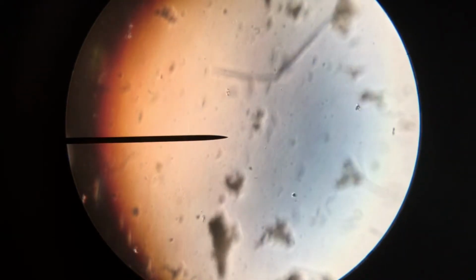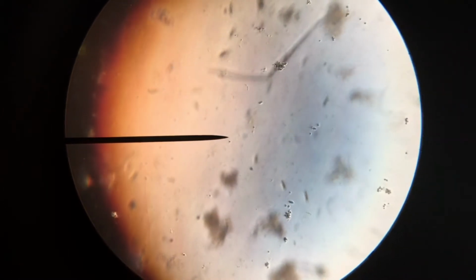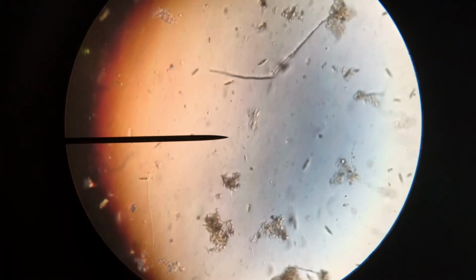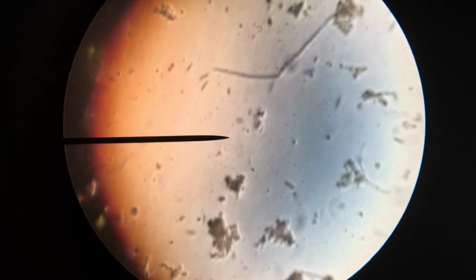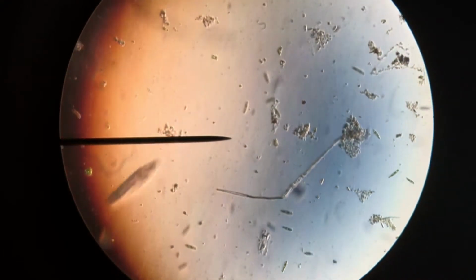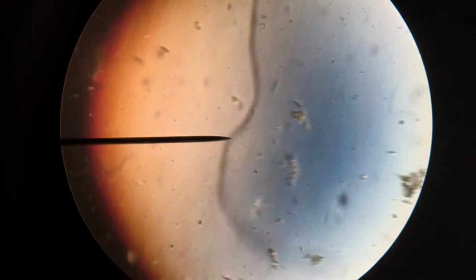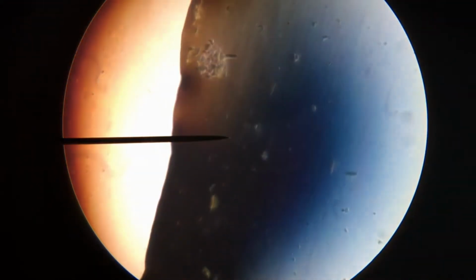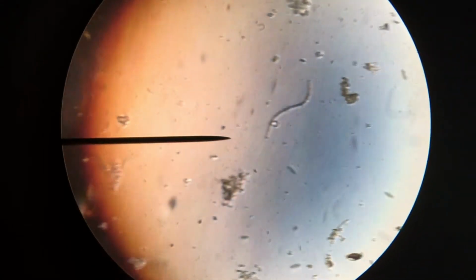Of course, for us, this is just a little drop of water, but for them, it's quite a deep lake. So I'm going to zoom from time to time and change the focus so you can see some of the critters swimming at different layers. Coming to the edge of my sample. Let's go back where it's easier to see.